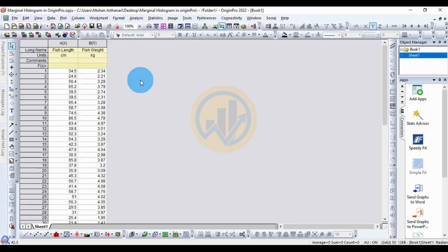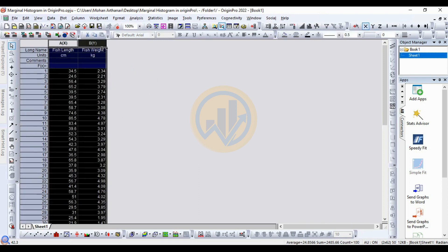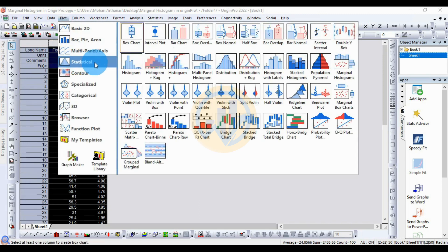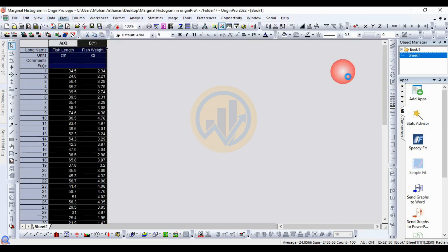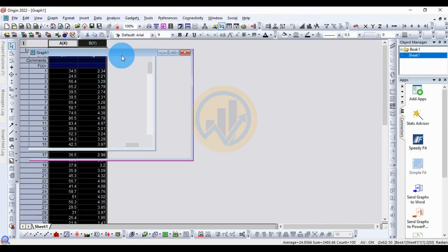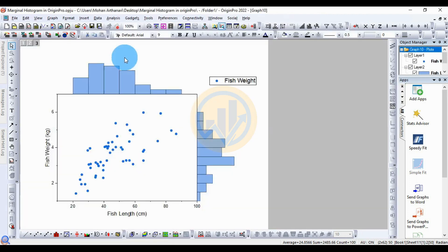In OriginPro software, select the data and go to the Plot menu, then go to the Statistical options and choose Marginal Histogram. Click it and it will open a new tab with the marginal histogram graph.